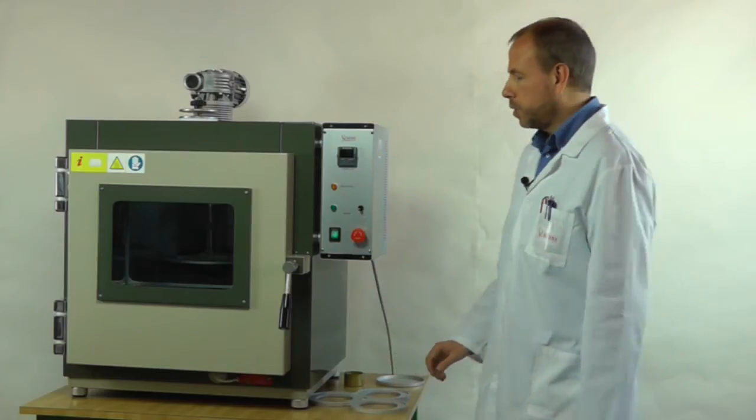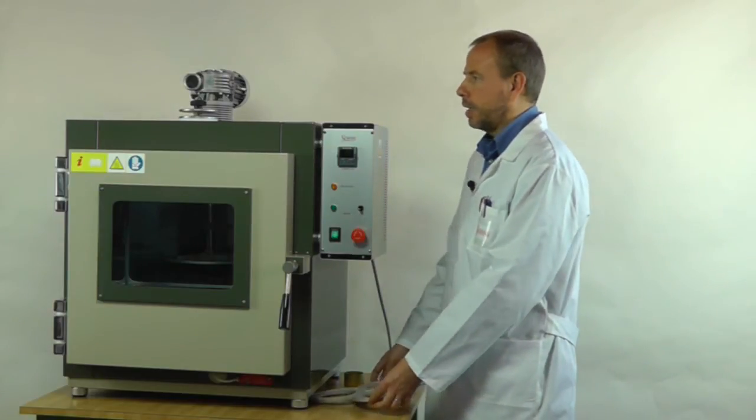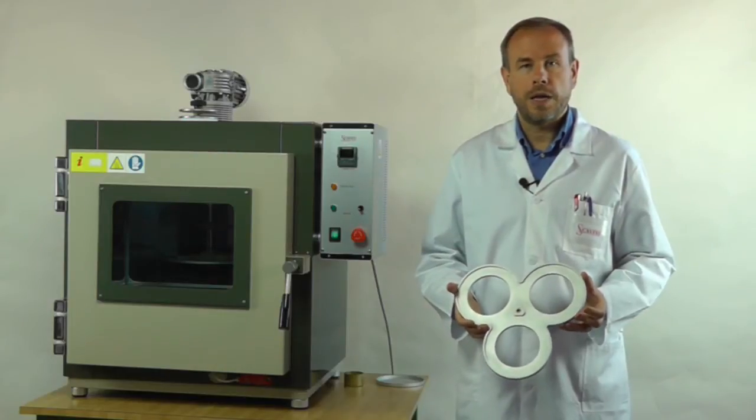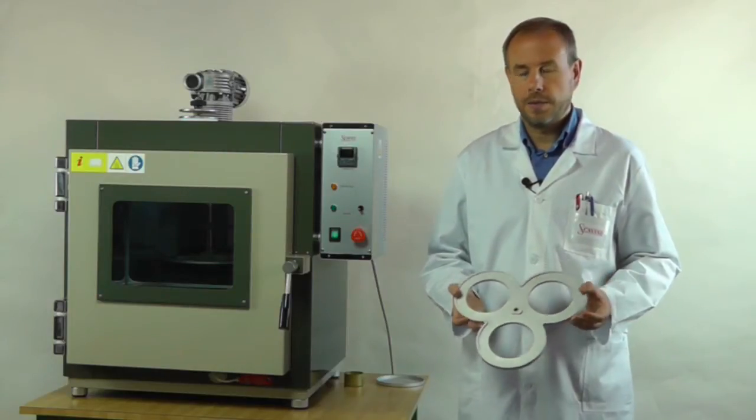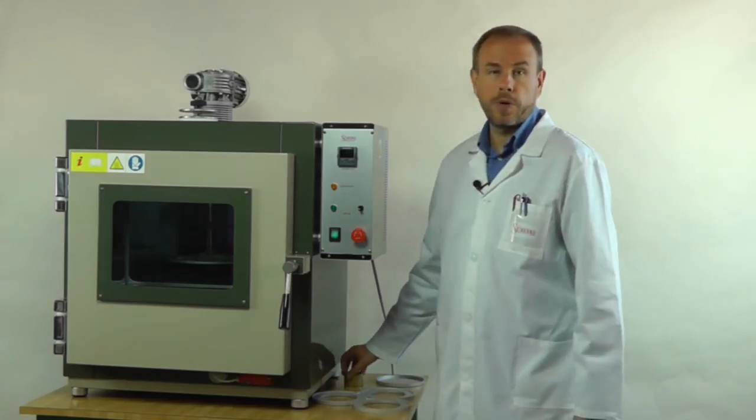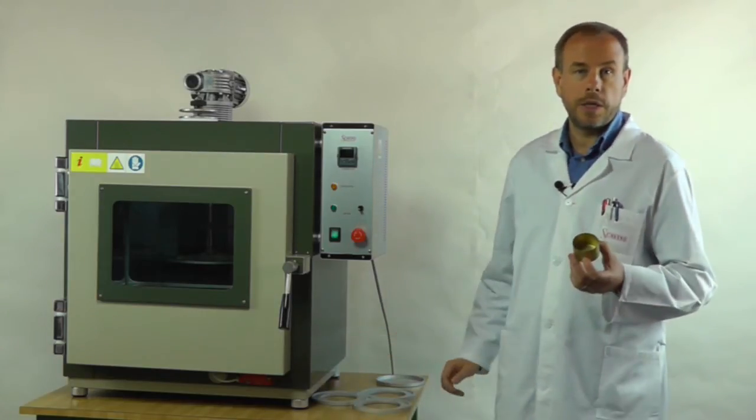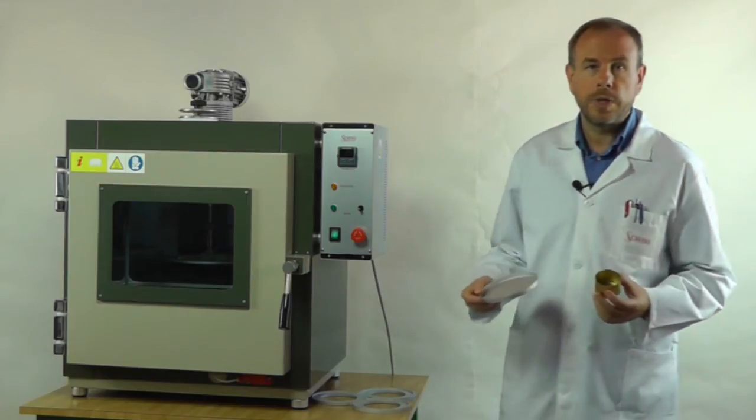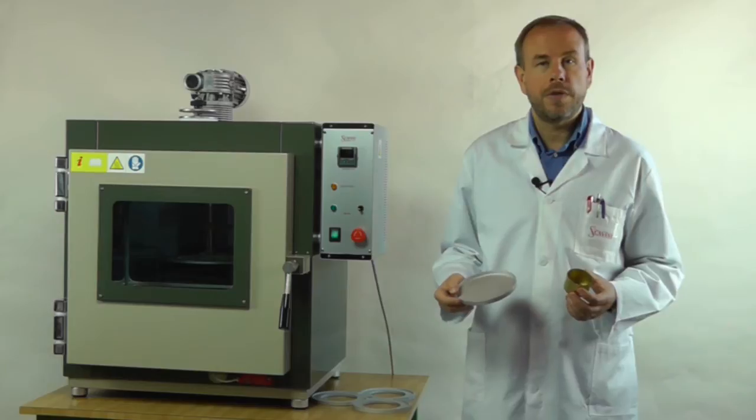This equipment can be used also for tests according to ASTM D1754, by simply replacing the shelf with this shelf in my hands. Also the sample container should be changed. This one is the sample container for D6, this one is the sample container for D1754.